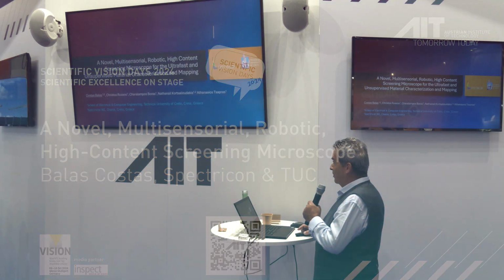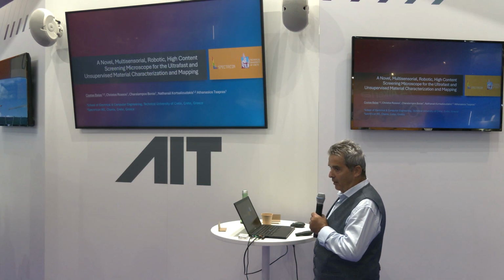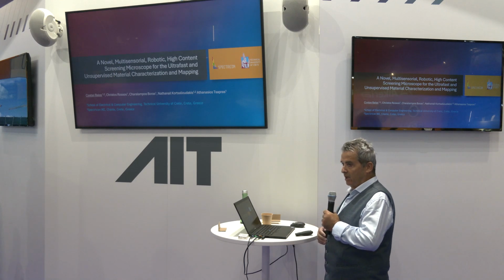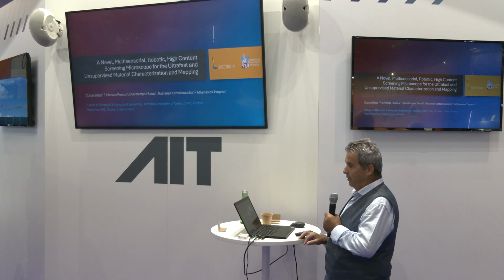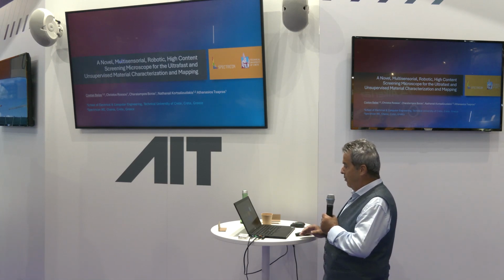Thank you so much. It's a pleasure to be here to present our developments on high throughput screening microscopy. Actually, we are developing multisensorial, hyperspectral and multimodal microscopes for identifying massive populations of targets in microscopy.